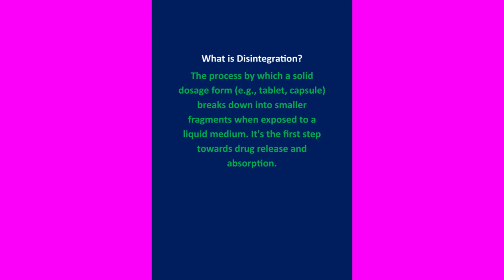What is the purpose of a disintegration test? To ensure that tablets or capsules break down into smaller particles within a prescribed time limit, which is essential for subsequent dissolution and absorption of the active pharmaceutical ingredient in the body. It's a key quality control parameter.